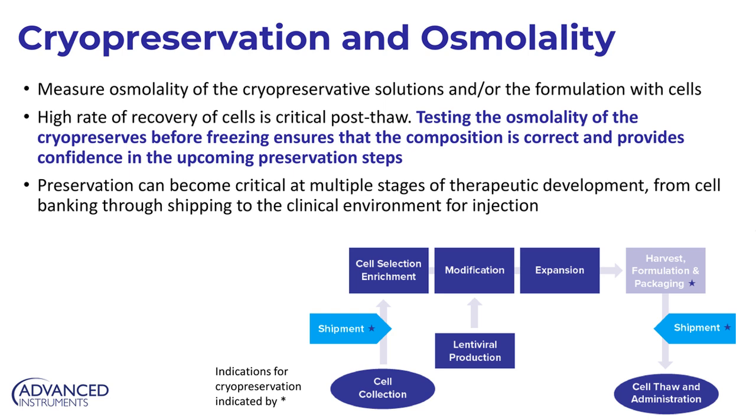So here, I just wanted to highlight, and I'm sure many of you are familiar with this, the point of this diagram is really to just say that any time that you have cryopreservation as part of your process, it would be a really great time to consider using osmolality testing to make sure that the osmolality or any pressures that could be affecting the integrity of the cells is not changing from one step to the next.